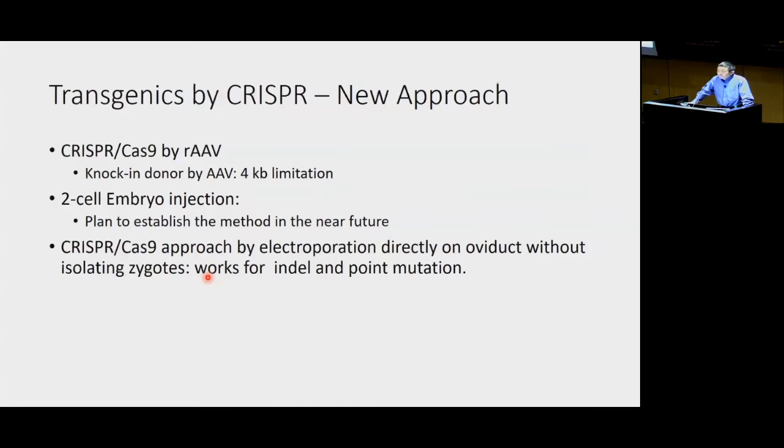Do you know if the genome engineering shared resource will provide recombinant AAV vectors? At least at this point, they will not do that. But there are outside companies that can do this kind of work. If you have some template, you design the mutations, and then you can ask the company to package this into the AAV.